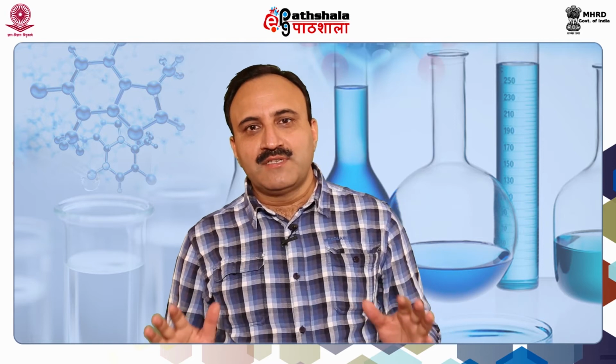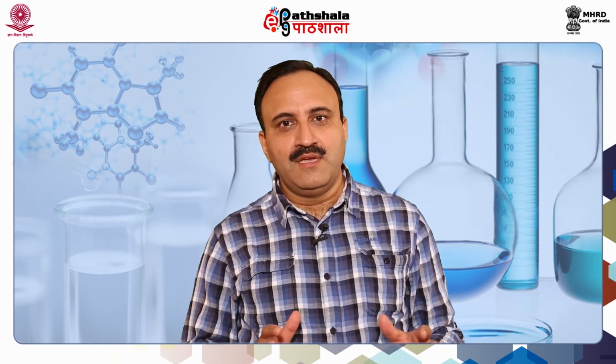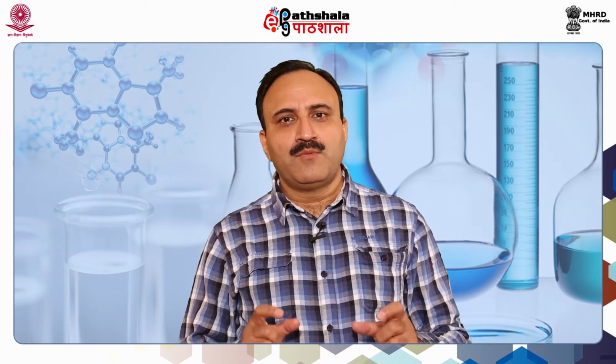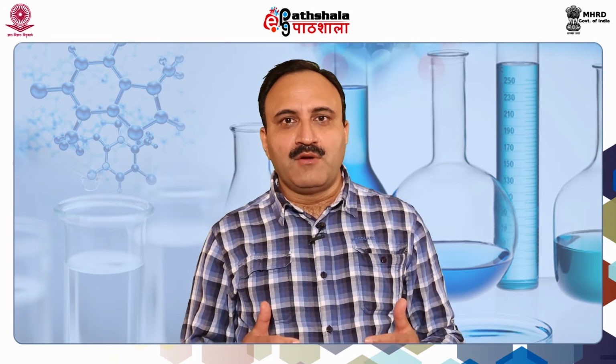So, today I will be discussing with you one of the very important, familiar and versatile techniques in the field of chemistry, that is gas liquid chromatography, or in short, its popular name is GLC. This technique is based on the principle of partition chromatography.